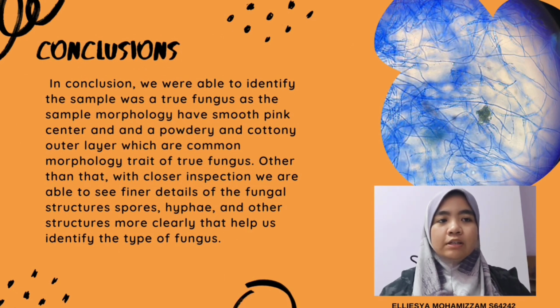We are able to identify that the sample was a true fungus, and it has a smooth pink center with a powdery cottony outer layer, which indicates that it was a true fungus. Other than that, with closer inspection, we are able to see the finer details of the fungal structures such as spores, hyphae, and other structures more clearly, which helps us indicate that it was a true fungus. And that's all from us. Thank you.